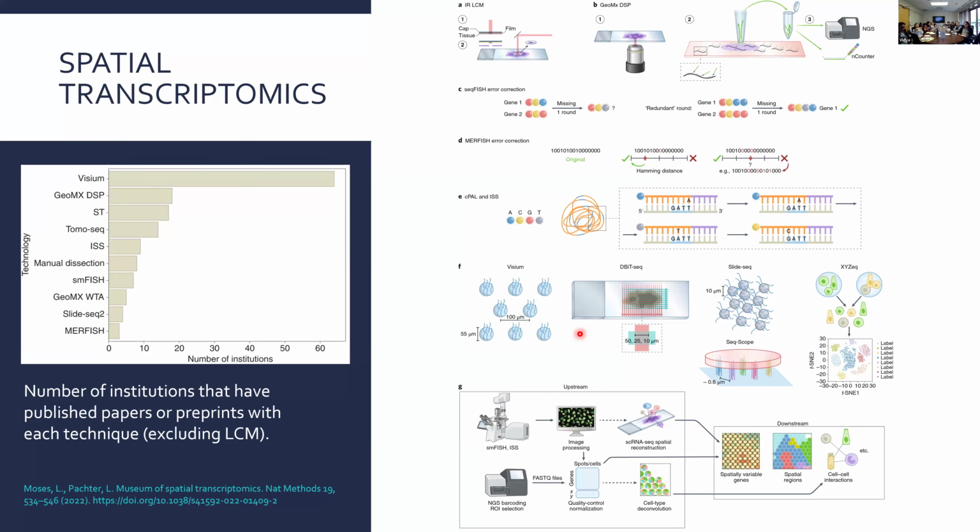But really the idea here is that not only are you getting the transcriptomic information of individual cells, but you're retaining where in the tissue that cell came from. That's really important, particularly if you're looking at rare cell types. On some of these techniques, you can use a laser to pick individual narrow regions of interest and pull cells directly from that region, if that was what is most interesting to you.